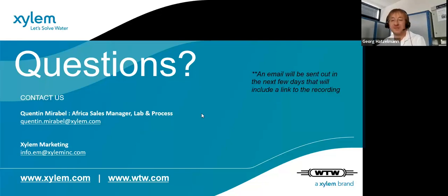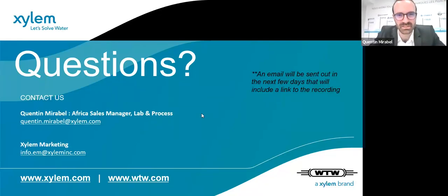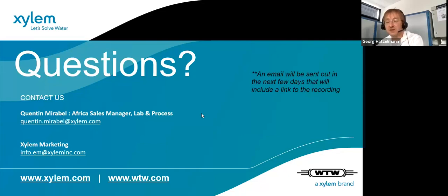Okay. Another question: what is the difference between SAC 254 dissolved and COD for the UV-705 sensor? Short explanation: the UV-705 sensor is a one-wavelength sensor measuring SAC, the spectral absorption coefficient, at 254 nanometers. From the SAC we can also calculate with this sensor the COD dissolved. The COD DS is COD dissolved. So it's a correlation between spectral absorbance and the COD concentration.